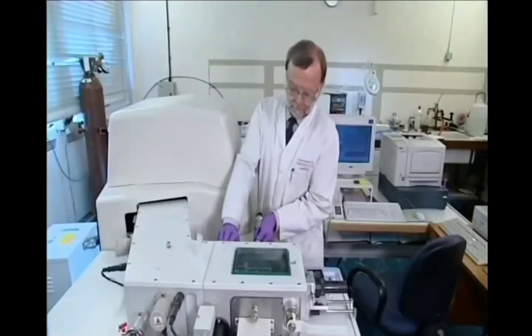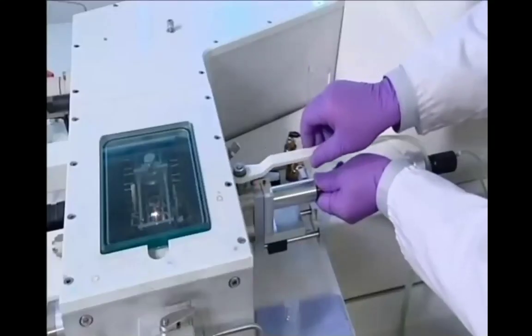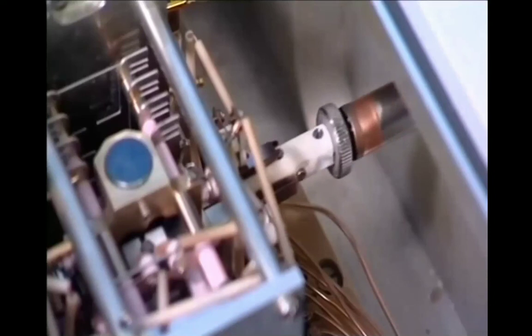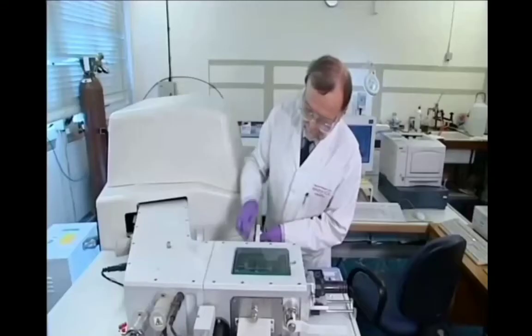The sample tube is placed in this probe, which is then inserted into the instrument via an airlock, so that the vacuum in the instrument is maintained. Volatile samples will vaporize at the low pressure inside the instrument, but the probe can be heated to vaporize less volatile ones.